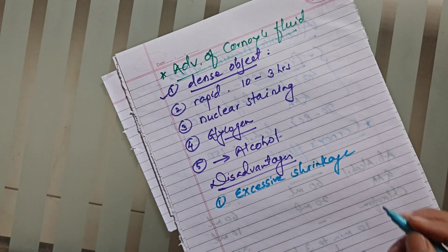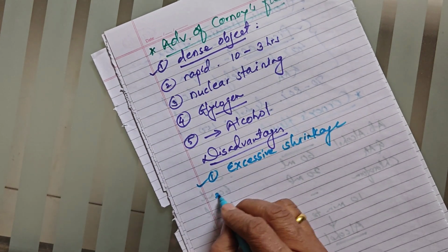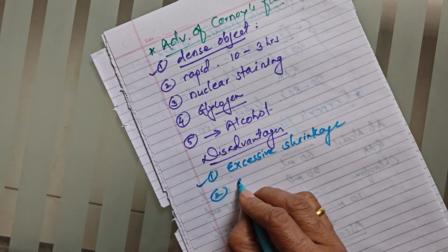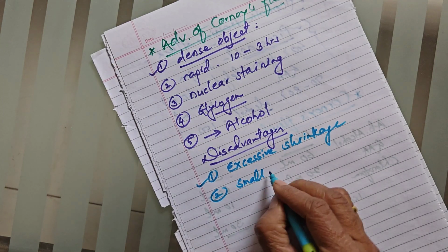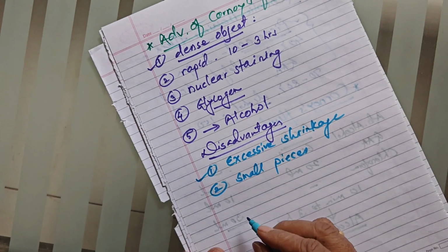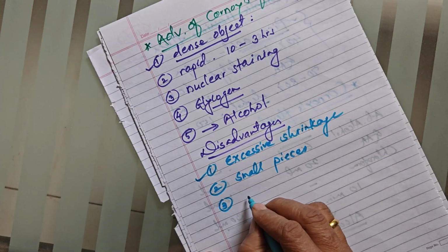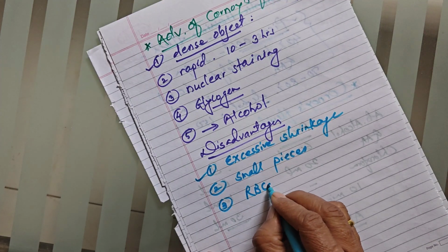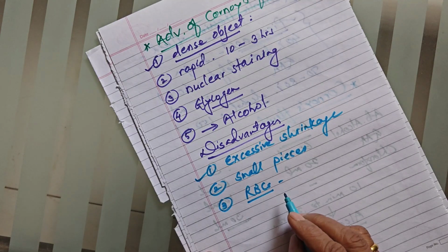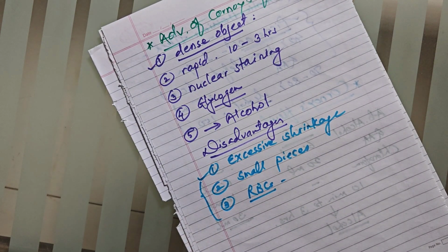The second disadvantage is that it is suitable for only small pieces of tissue. And the third is that in this fluid, RBCs are broken down. They get burst. So these are the disadvantages of Carnoy's fluid.